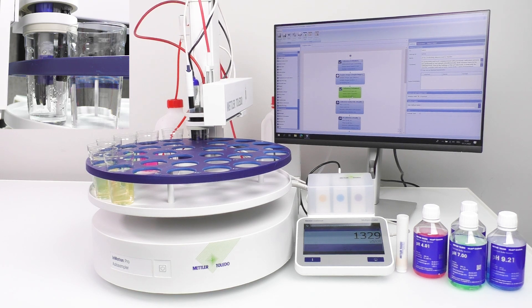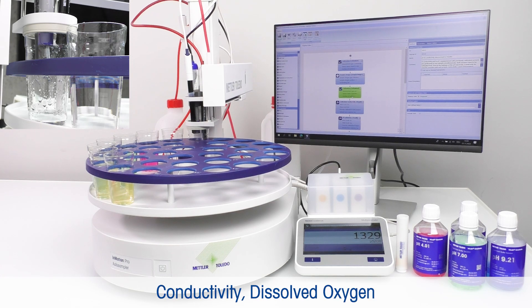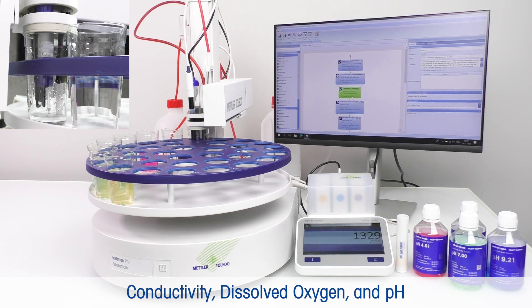Our innovative solution allows for the measurement of the three most common parameters — conductivity, dissolved oxygen, and pH — all simultaneously.